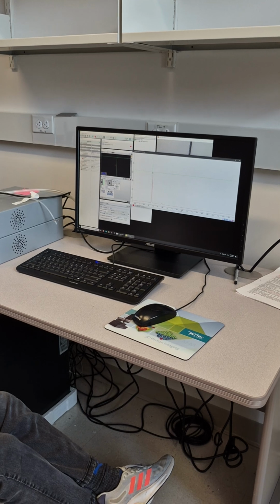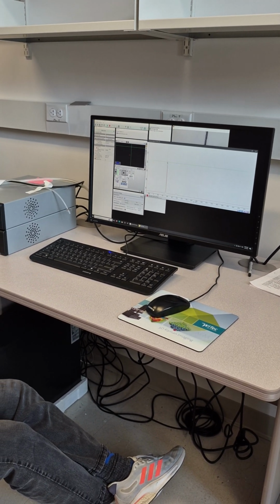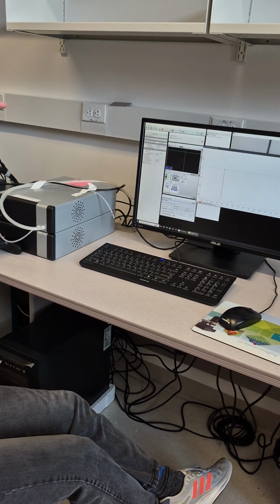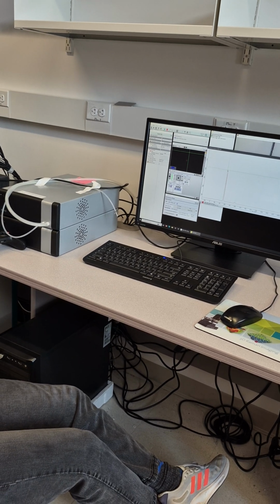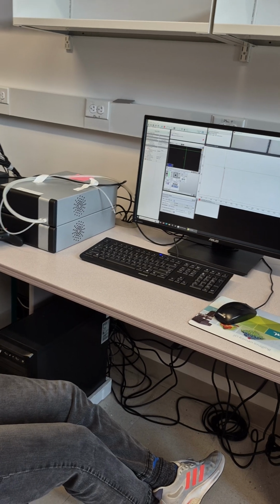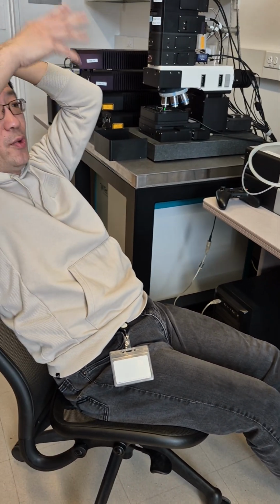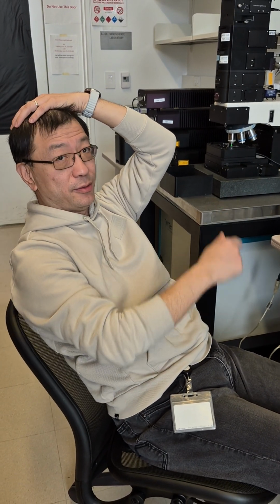If the peak count goes below, let's say, 400 or 300 counts, that means the laser drifted too much. I need to do the alignment, and you don't touch the alignment, so you can find me. I'll do the alignment. Every other day I will check the alignment, so in 1 week I will at least check the 532 laser alignment twice.